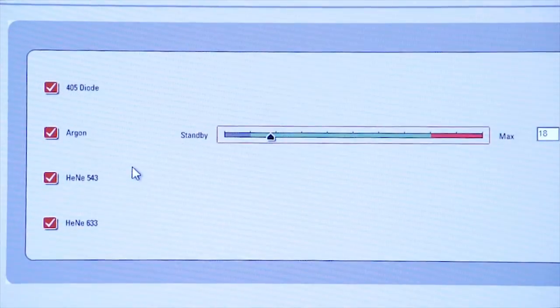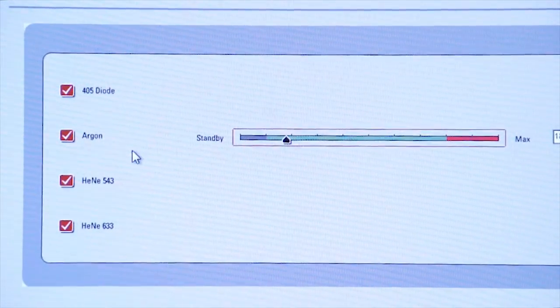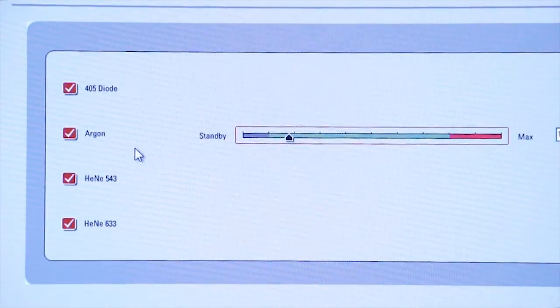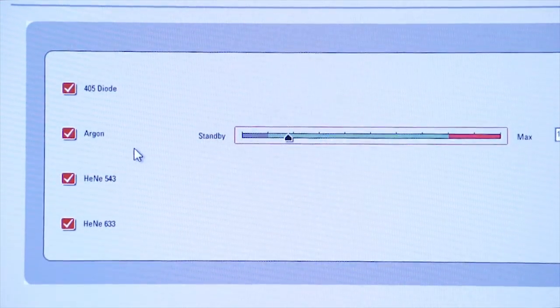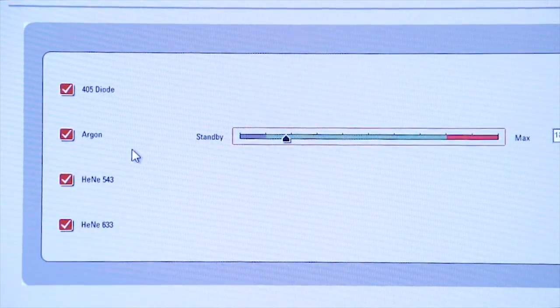The rule of thumb is to use as little power on the lasers as possible, as this will prevent photobleaching, which you will see in due course.